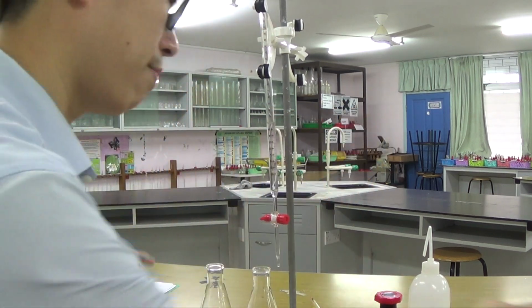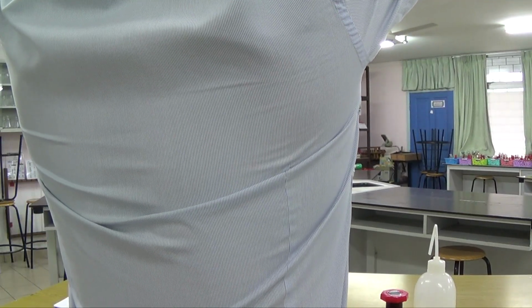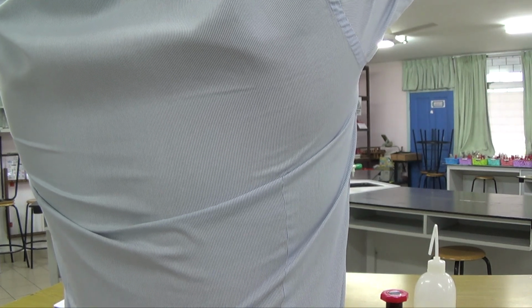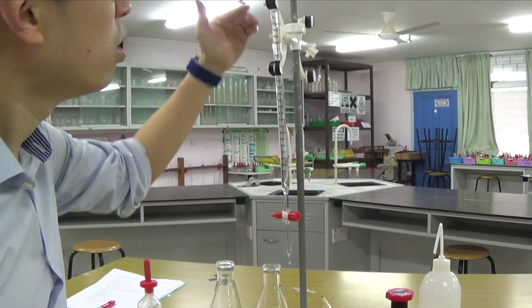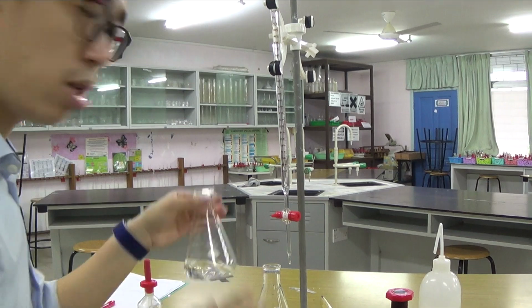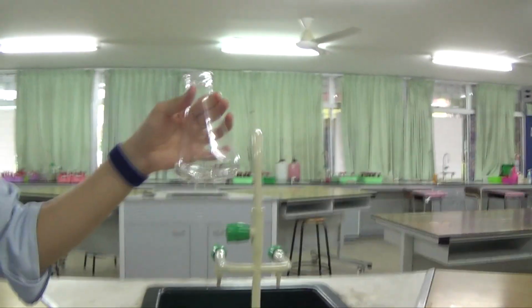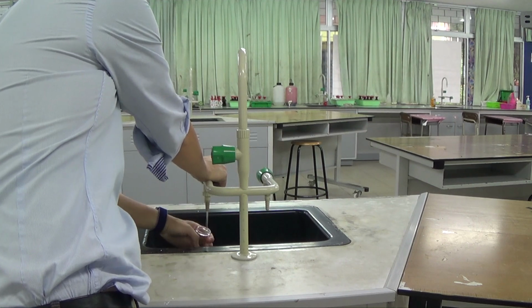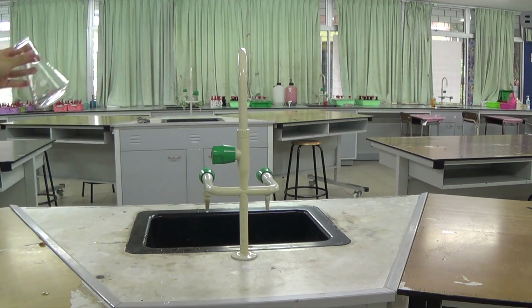Anyway, let's refill our burette a little bit with this thiosulfate colorless solution. I don't need a lot of it. I could fill it up to around 21, 22, and since my exact titre was around 20, I will have enough anyway, okay? So I'm just going to quickly wash my conical flask with tap water first, throw it in the sink, and then I'll quickly rinse it with distilled water.